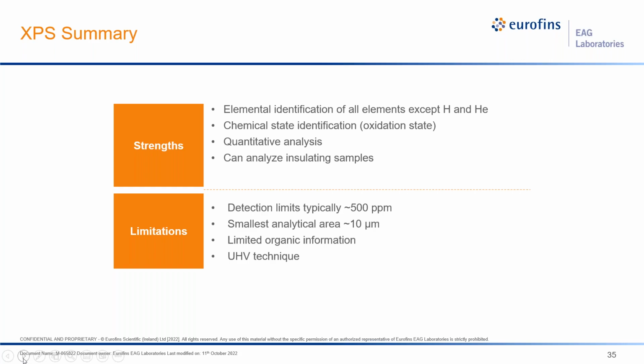But like with TOF-SIMS, on some of the instruments we have cold stage capabilities where we can freeze some liquids or freeze materials which have volatile components on the surface to preserve them and analyze. And contact lens, by the way, is one of the typical samples for which we often use cold stage applications.